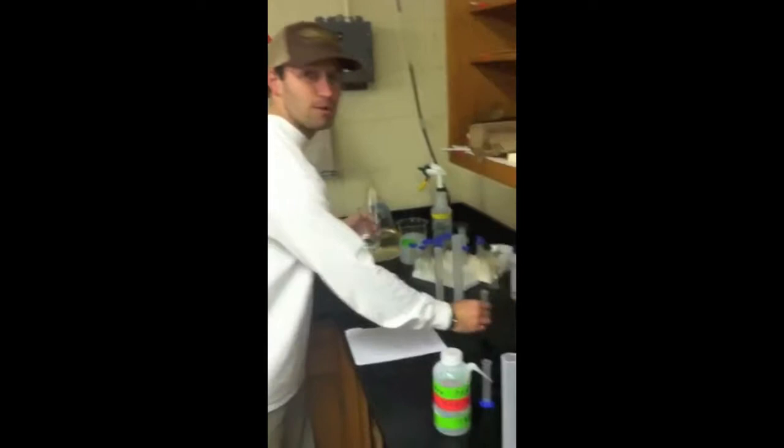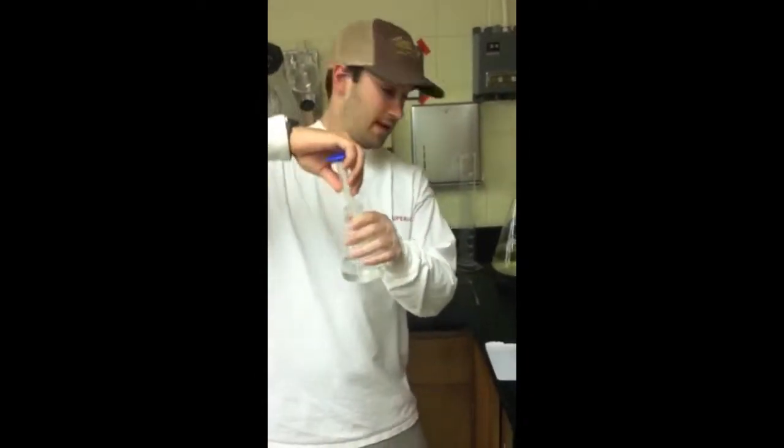Next, you need 2.5 mL of 50X TAE buffer, poured into the 250 mL Erlenmeyer flask.